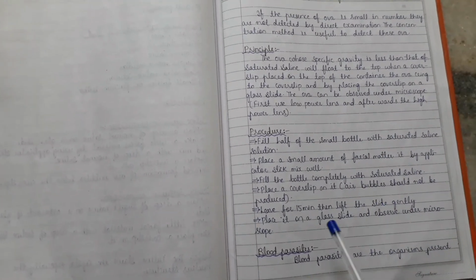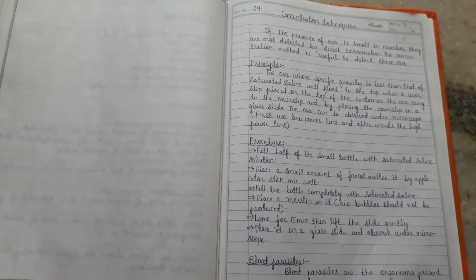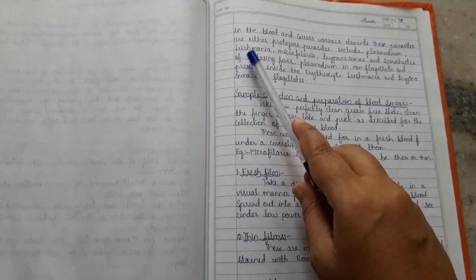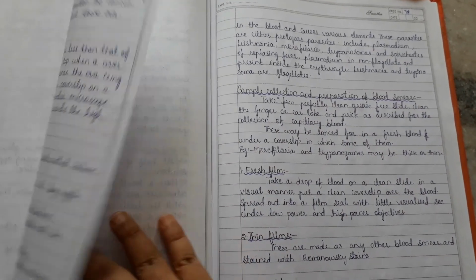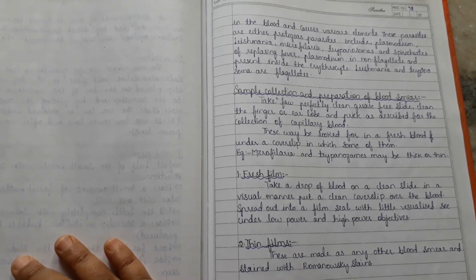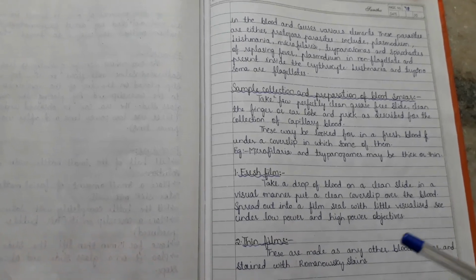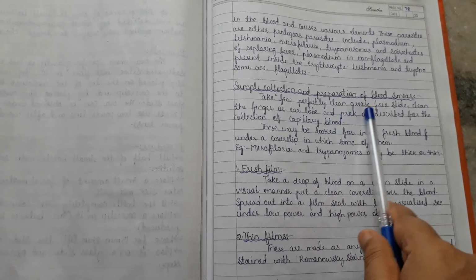And what are blood parasites? They are the organisms present in the blood. So these parasites are either protozoa. Parasites include Plasmodium, Leishmania, Microfilaria, Trypanosomas and Spirochetes. So sample collection and preparation of blood smear.